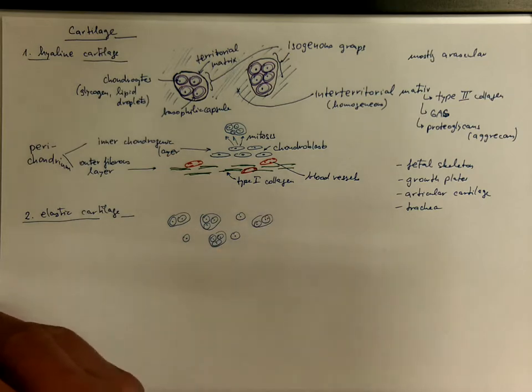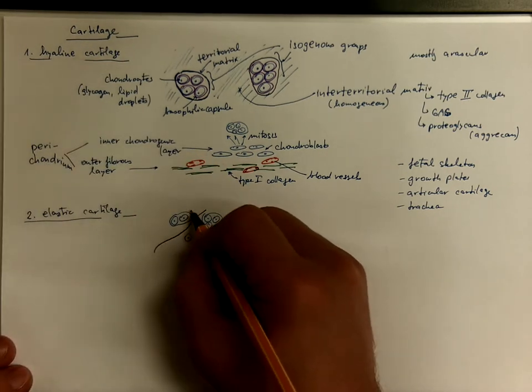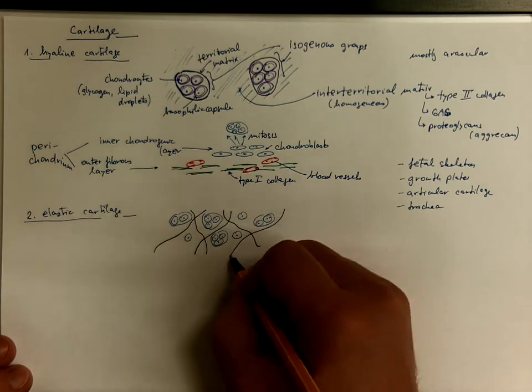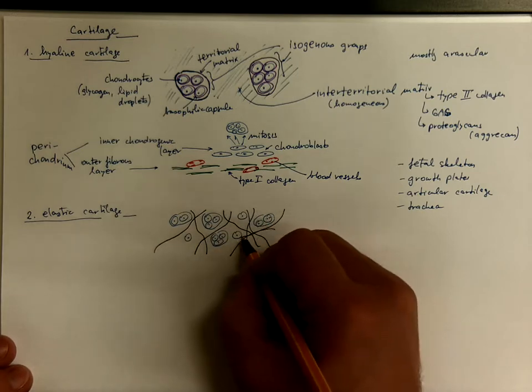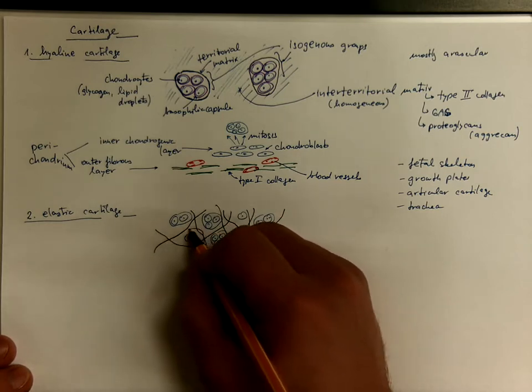But more interestingly, we got a very complex network of elastic fibers providing elasticity to the cartilage.